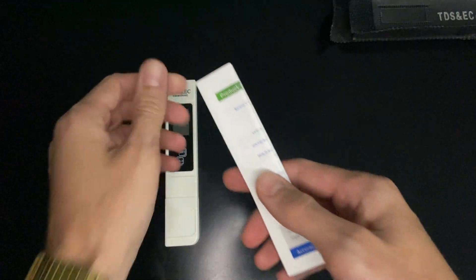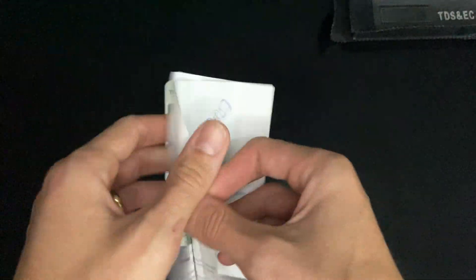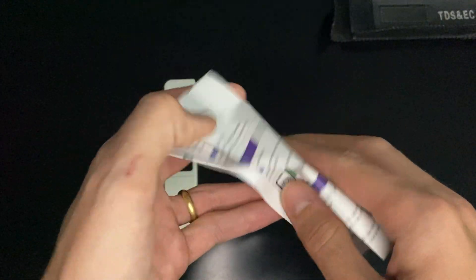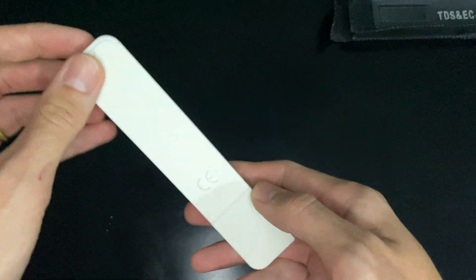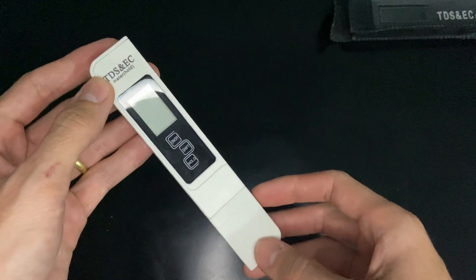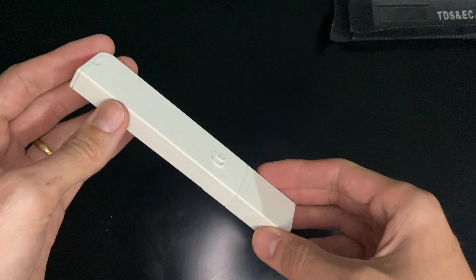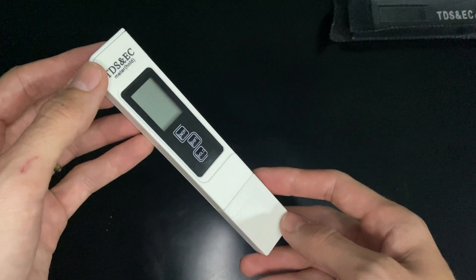And here is the manual. This instrument, the TDS, is used to measure the quality of water. TDS stands for Total Dissolved Solids.